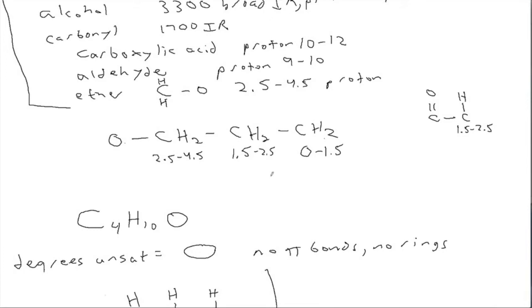Which of those two peaks is broad? The one on the right. You see how I call it broad? It's not sharp. It's broad. That tends to be typical of an NH or an OH. That's something that isn't written there on that table, so you should just memorize that.